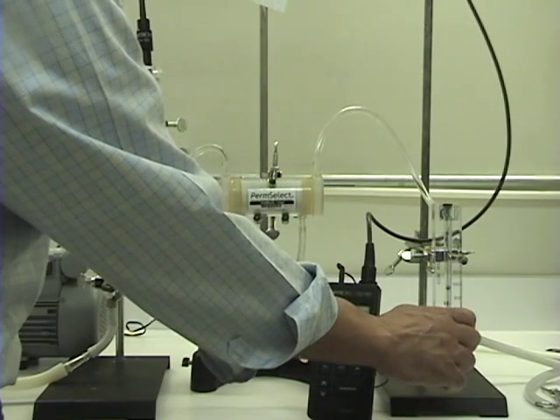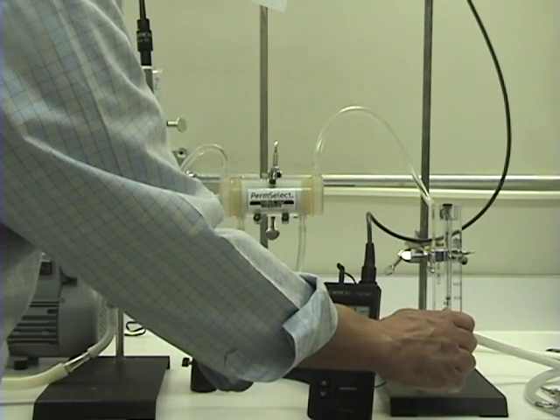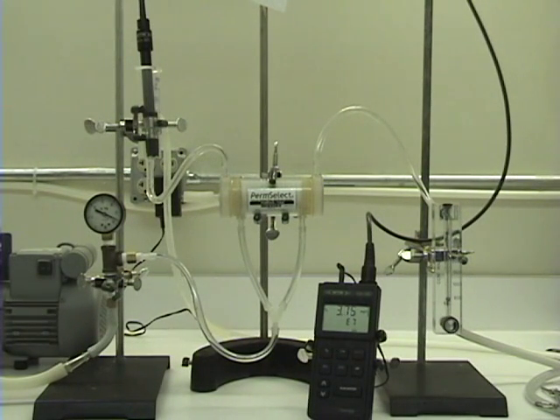If we reduce the flow through the module to half a liter per minute, we see that the total dissolved oxygen is reduced even further.